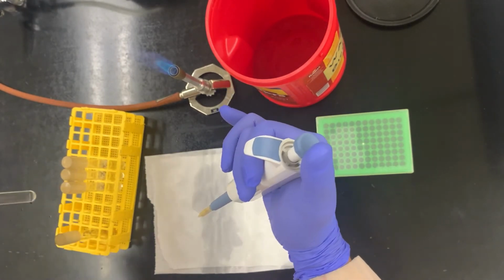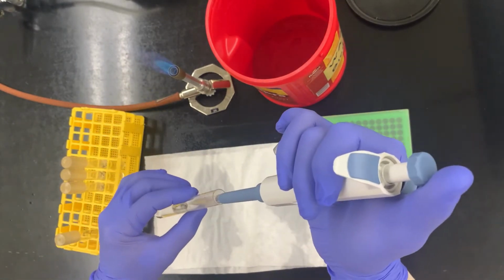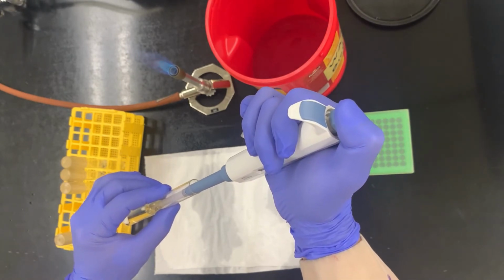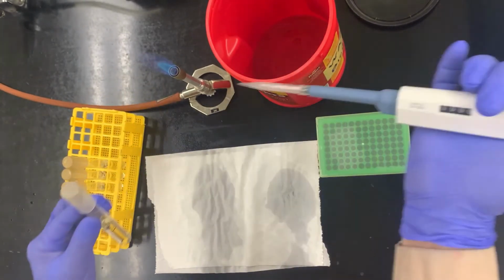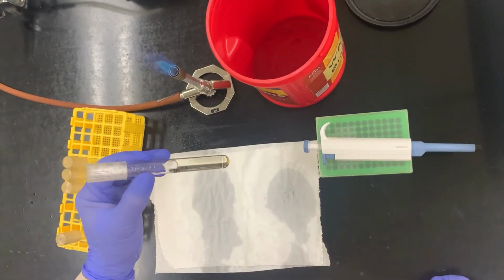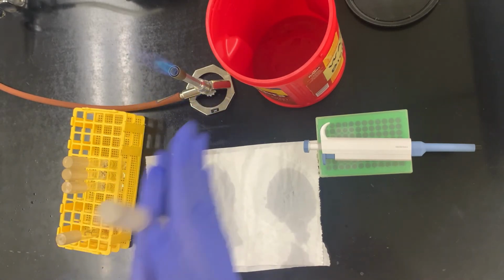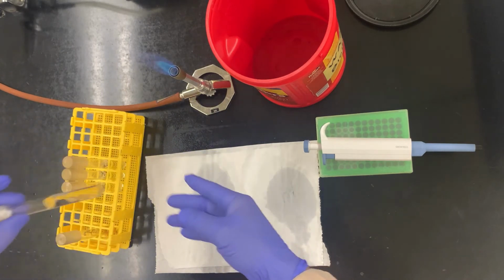I'm going to grab my 10 to the minus 1 once again, twist and pull, flame, and then into my liquid. I'm just going to put it right there at the interface. Nice and slow out. First stop, second stop, pull out, flame, discard. Okay, and so that's my first dilution. Now make sure we mix this very well, and remember, this is how we're going to mix. Okay, so let's pretend I mix this very well. Now I'm done my first dilution.